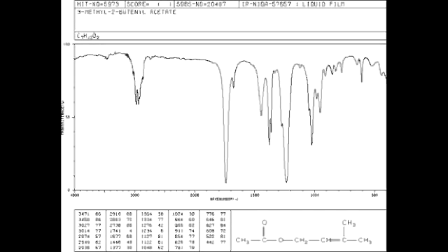So here, in fact, is the actual structure of the molecule and the name. And we can tell that it is an ester, although I didn't have time to mention that this is an ester that has a C double bond C here, as we can see. That should have been obvious because there's that little peak at 1680, it looks like, which is short and weak but sharp, so it's C double bond C.